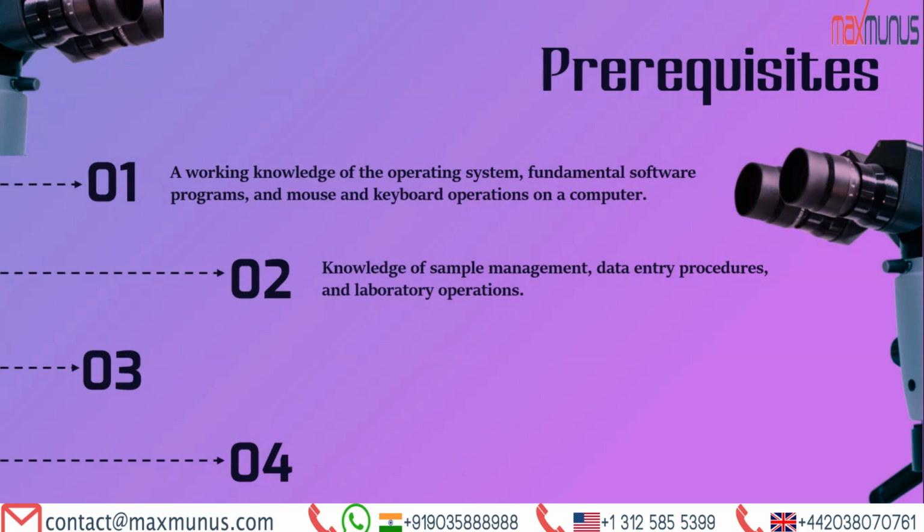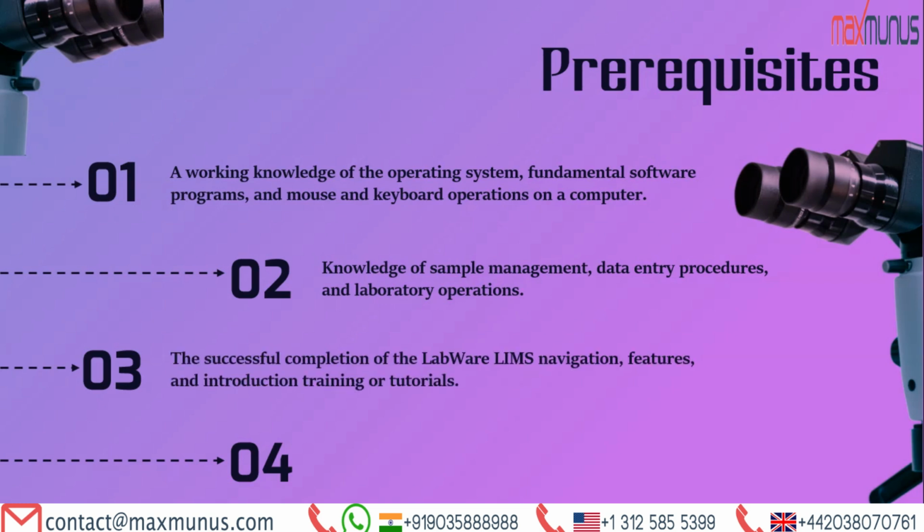Knowledge of sample management, data entry procedures, and laboratory operations. The successful completion of the Labware LIMS navigation, features, and introduction training or tutorials. Labware LIMS permissions and login credentials that are required.